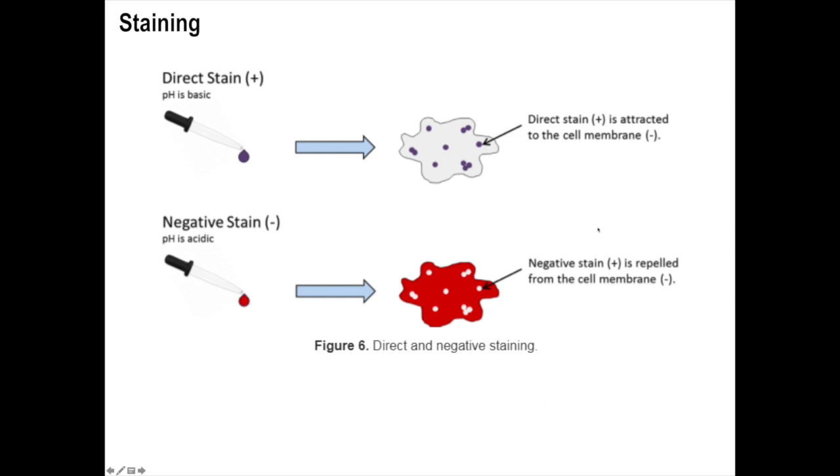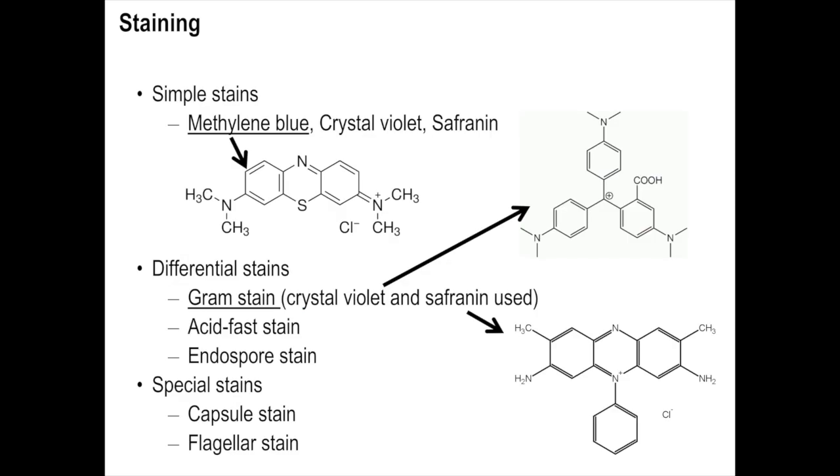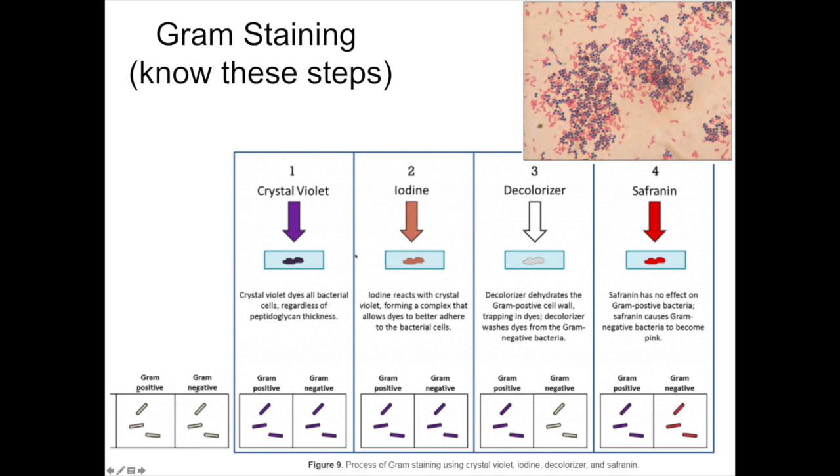In lab, you're not conducting negative stain. Don't worry about that. And this image is from hands-on lab as well. So you should be seeing this when you're doing the lab exploration section. Okay, so let's get back to this differential stain. And this image right here is also from hands-on lab. And what I did was I added this down here in the lower left to show you what the samples would look like before staining.